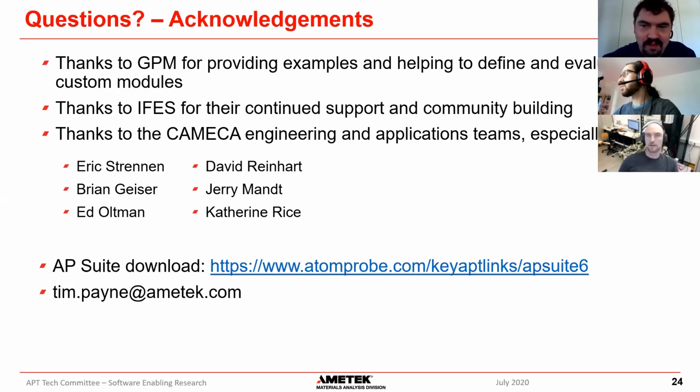Sure. TOF is raw TOF. TOFB, I believe, is bowl corrected time of flight, so like flight path corrected time of flight. The rawest form, if you wanted to do very basic reconstruction, you would want time of flight, voltage, and detector X and Y, quite similarly to the last talk, Patrick's talk.